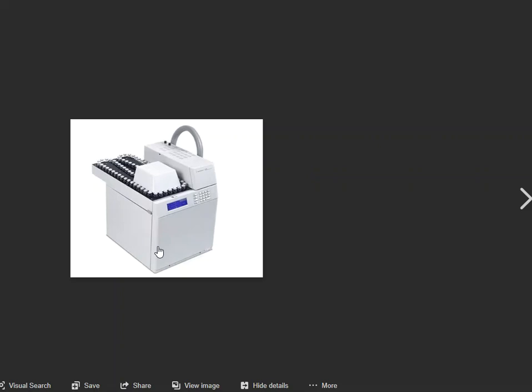Okay? Then this heating unit will go ahead and process sample number 2. It knows basically the run time. It knows everything that you're doing as far as sample processing goes because you've entered that in. And it will start sample number 2 and process it the proper way when it is ready for that moment in time. And then after that, it will send that second sample over. The GC kicks in and says, okay, I've got a sample now. This is number 2. And then it moves on to the second line item in your auto sampler batch.